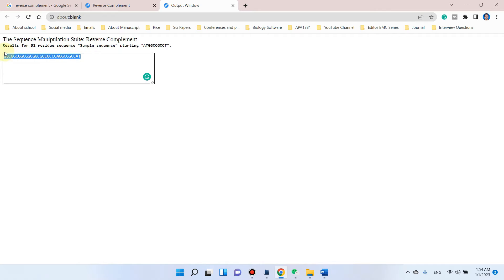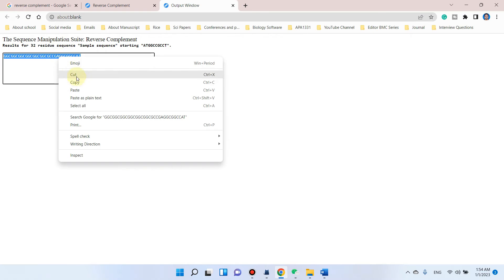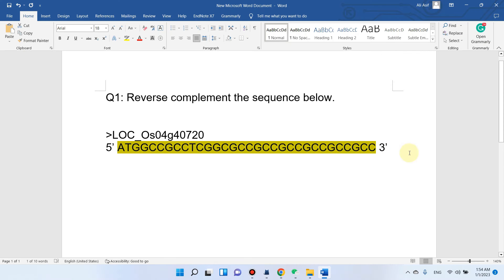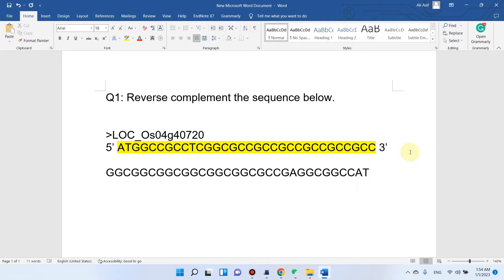You can see here the next window is showing the reverse complementation of the 32-residue sequence. You can simply copy it here and paste it back into your file. Now you can see this sequence has already been reverse complemented.